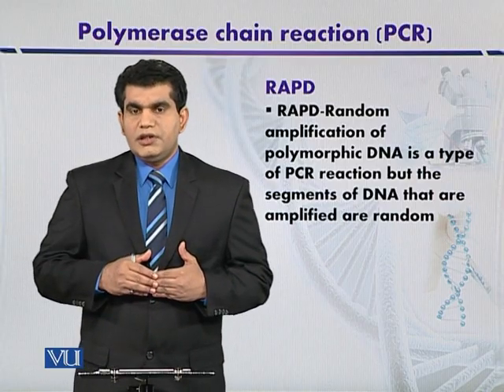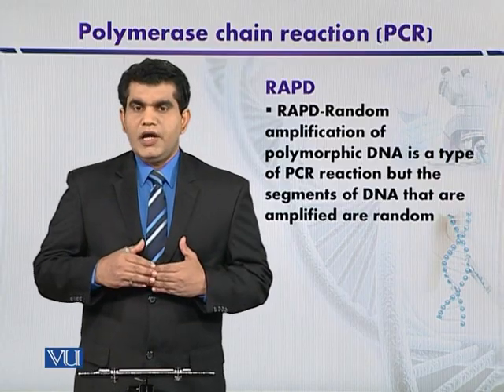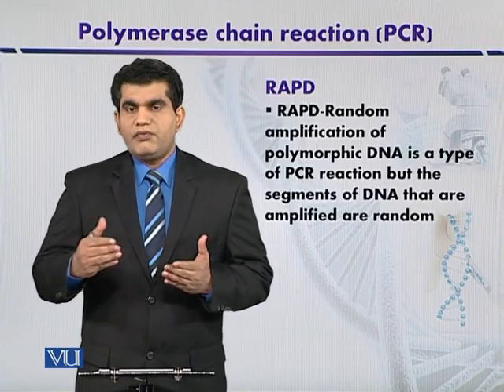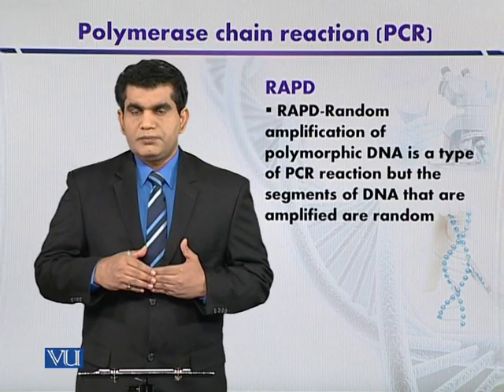This technique was developed several years ago, and it finds its application in finding evolutionary or phylogenetic relationships among different species.